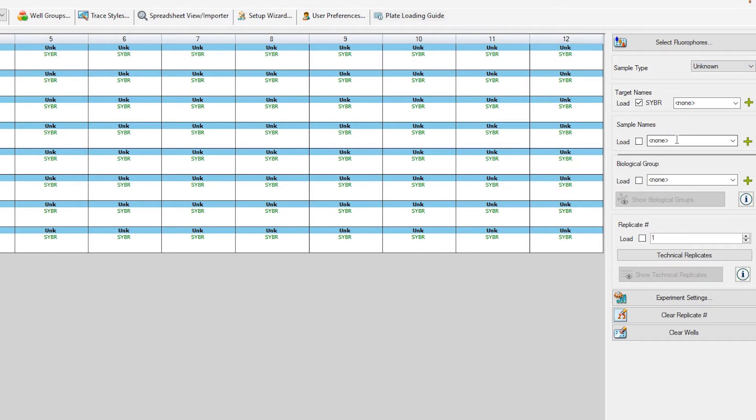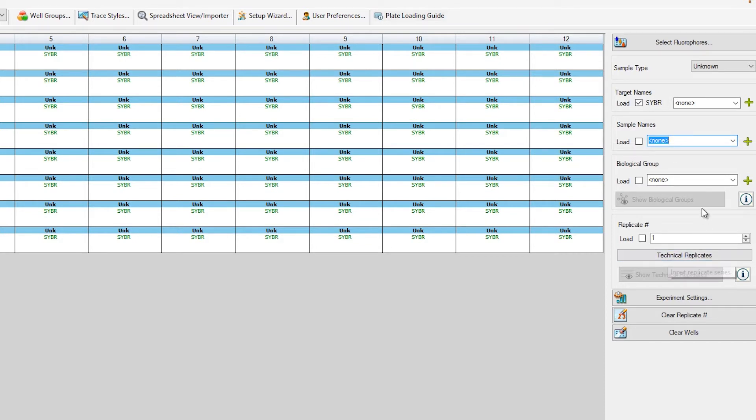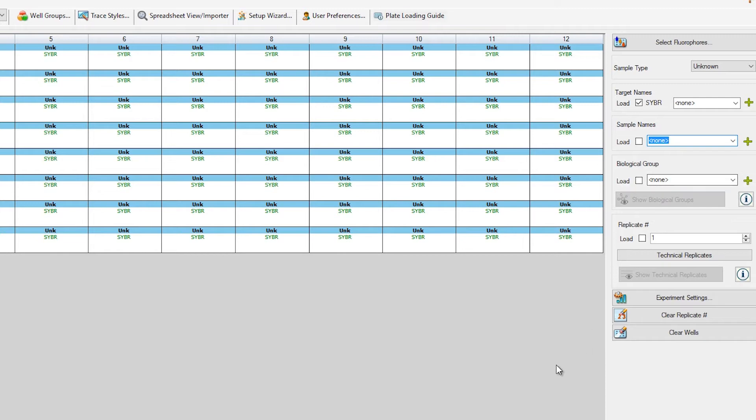You can also name each sample, assign technical replicates, biological groups, and easily create your standard curves.